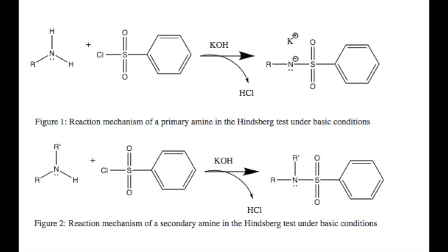After a functional group is suspected, a functional group test can be performed on the unknown compound to further characterize the chemical. The test that was performed on the suspected amine was the Hinsberg test. This test is used to discriminate between primary, secondary, and tertiary amines. Figure 1 is an example mechanism of how these tests work.